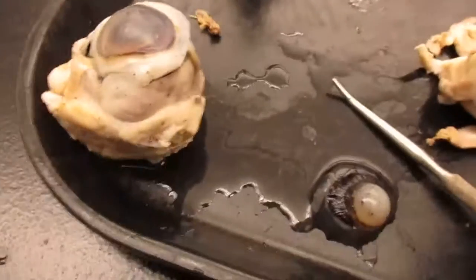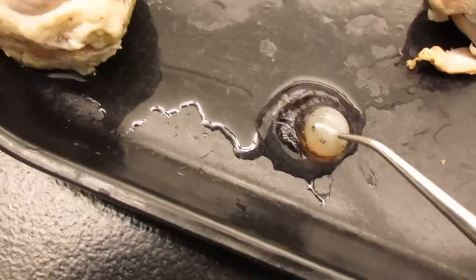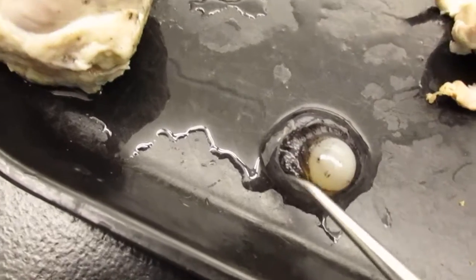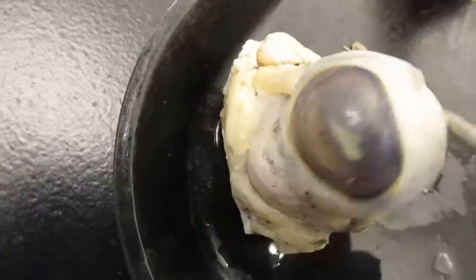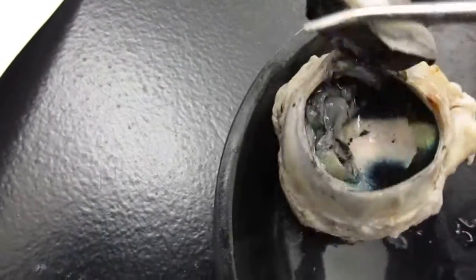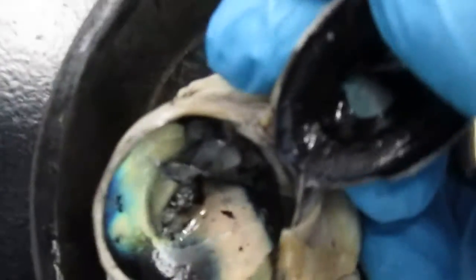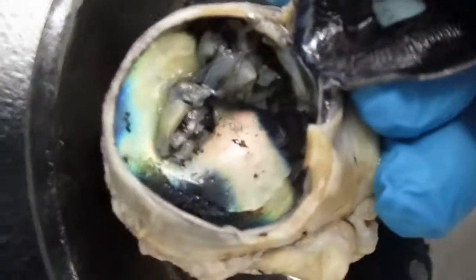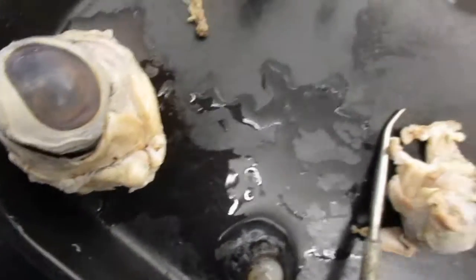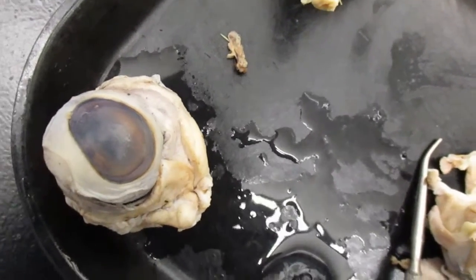Okay, now I got that taken care of, and now I'm going to show you the lens right here. Here's your vitreous humor right here, and here is the retina right here. Here's the retina right here. And then the shiny stuff is the tapetum lucidum. And that's all of the sheep brain, as well as the sheep eye dissection.